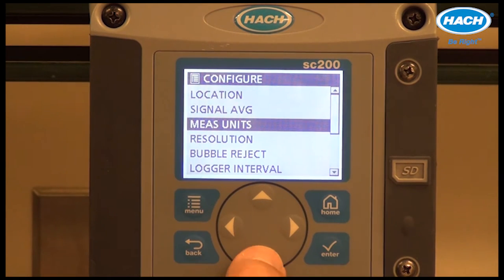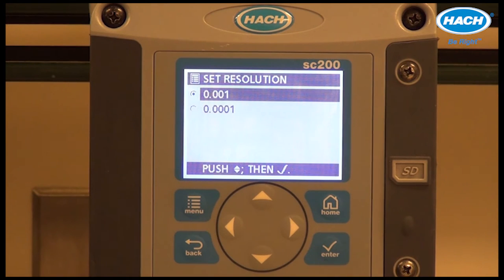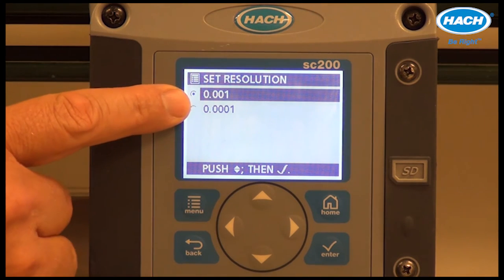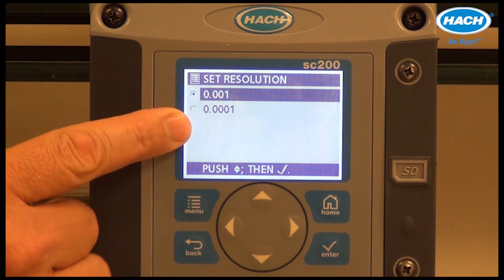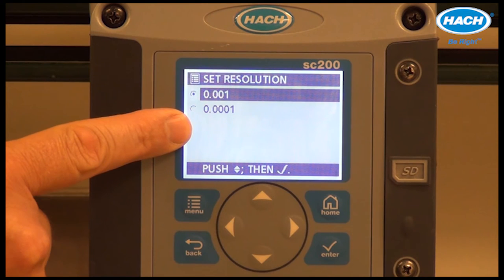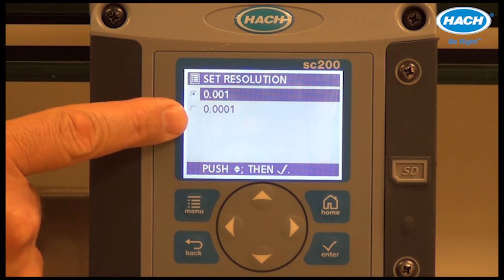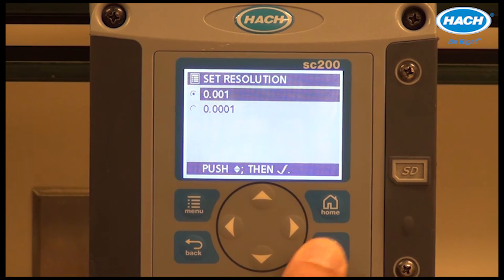The resolution setting allows the user to select thousandths or ten-thousandths resolution — three or four places to the right of the decimal — depending upon the typical measured values.